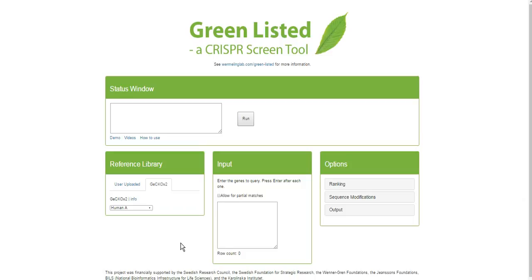The exercise that GreenList does for you is that you provide a list of genes, and GreenList will suggest a CRISPR library that you should make to create a screen targeting all of those genes. The way it does it is that you either upload a reference library yourself, or you use the GeCKO version 2 that's embedded, which contains lists of suggested gRNAs for particular genes. Then in the input box you tell the software which genes you want to target.